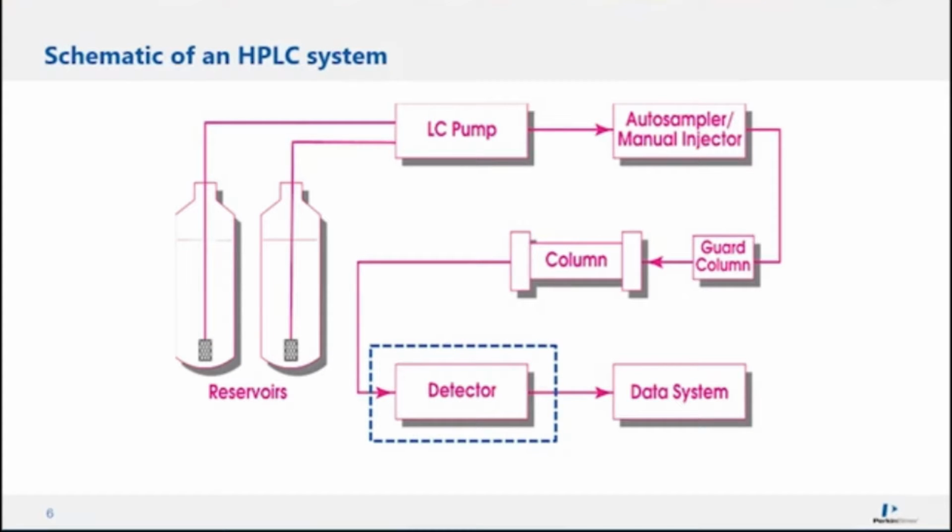The detector or the detectors that you choose will be dependent on what you are trying to detect and at what levels of concentration. I'm going to say that again because that's a really important key take-home statement. The detector or the detectors that you choose will be dependent on what you are trying to detect and at what levels of concentration.